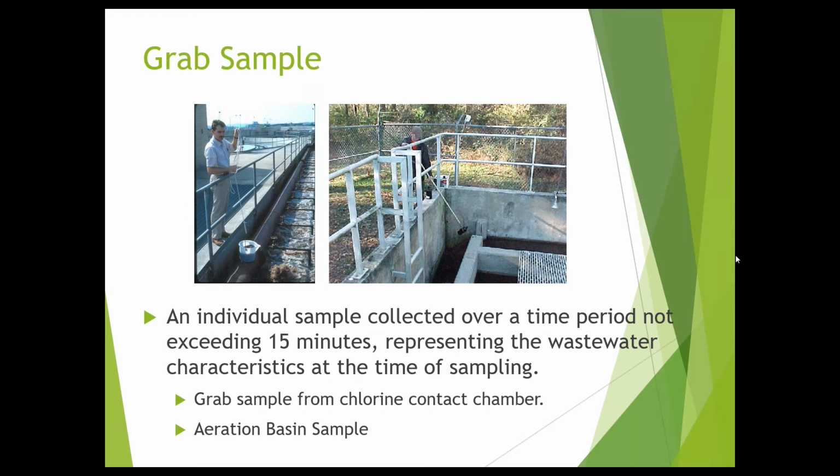I'll keep going as fast as I can. Are there any concerns with using an auto sampler to flow composite for BNA, base neutral acid analytes, then pouring off after a 24-hour sample period and preserving as necessary? I'm not sure about that. If you send me an email, I can look that up and get back to you. All right, I'm going to keep moving.